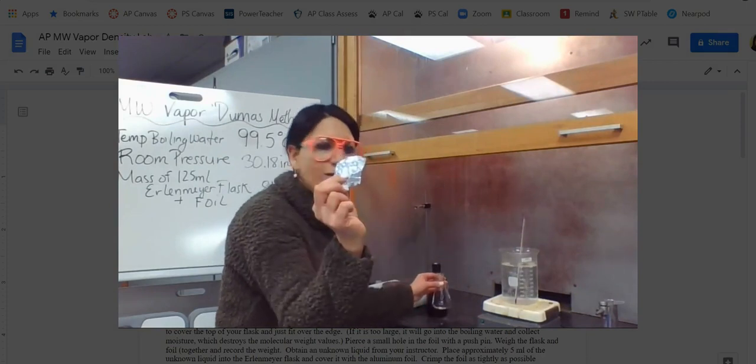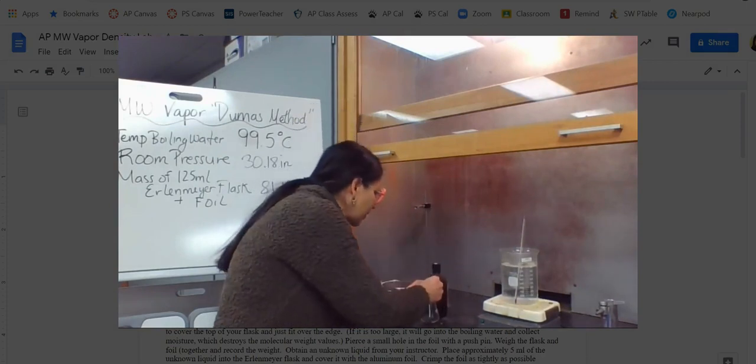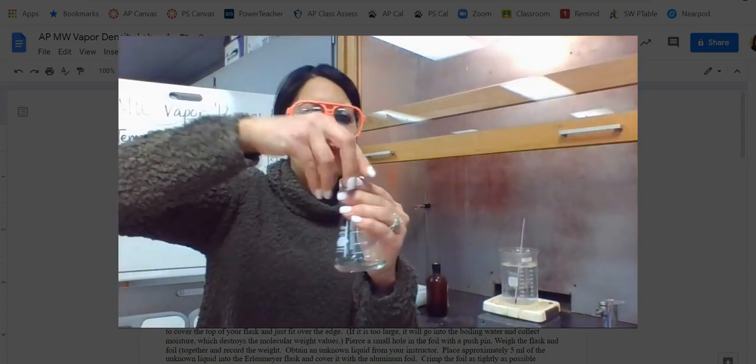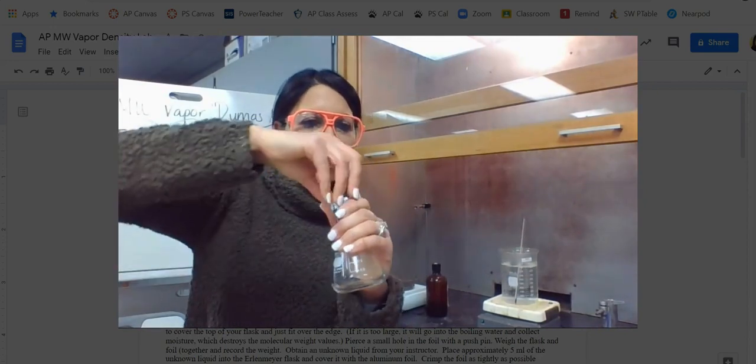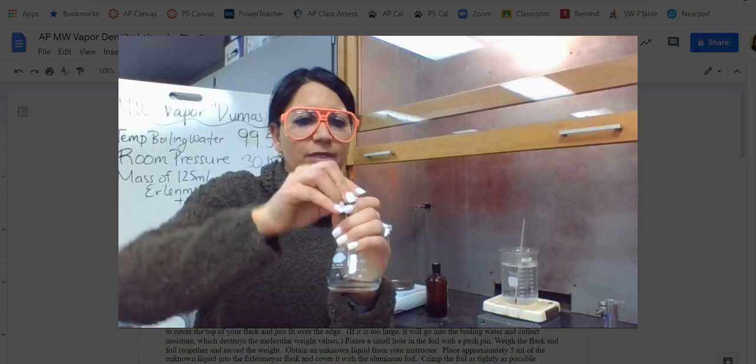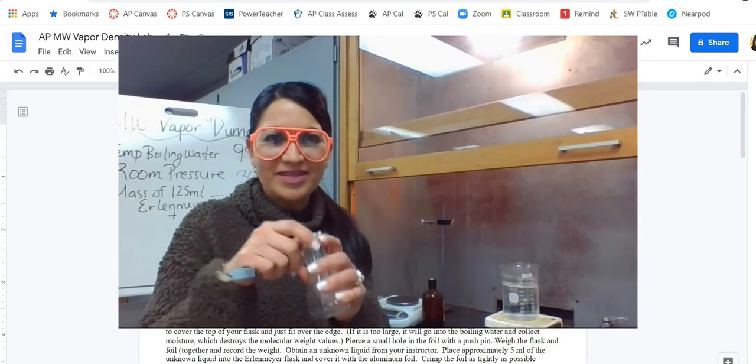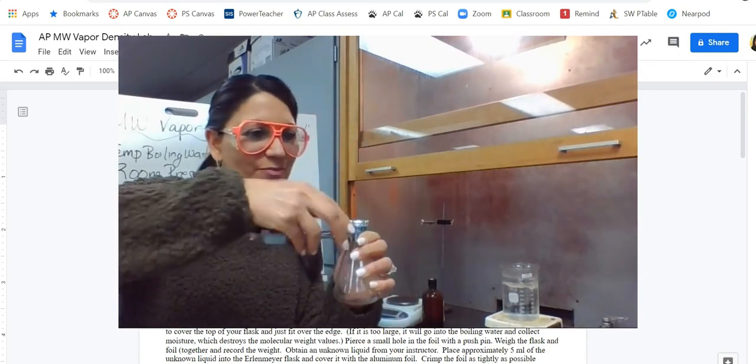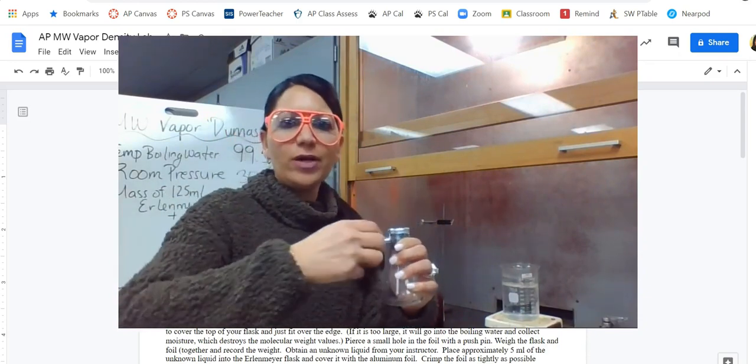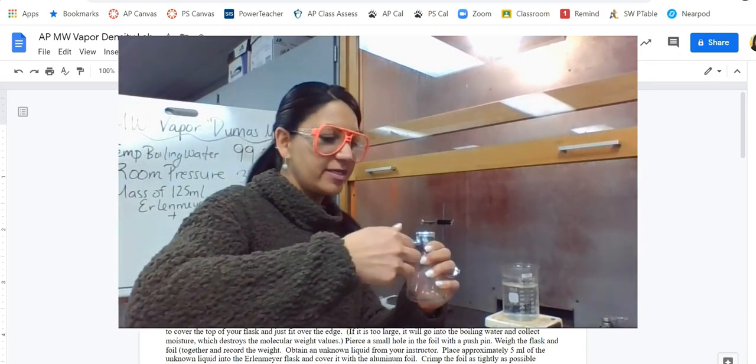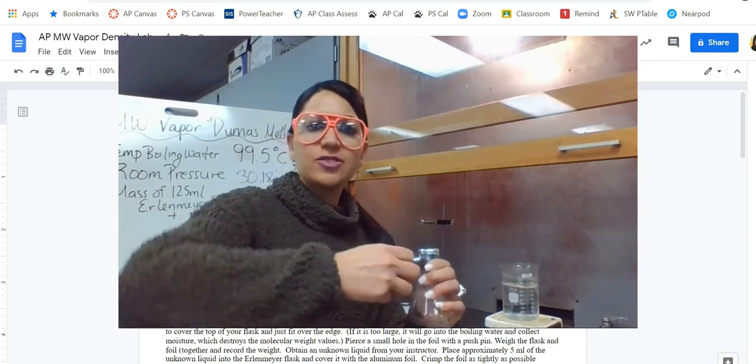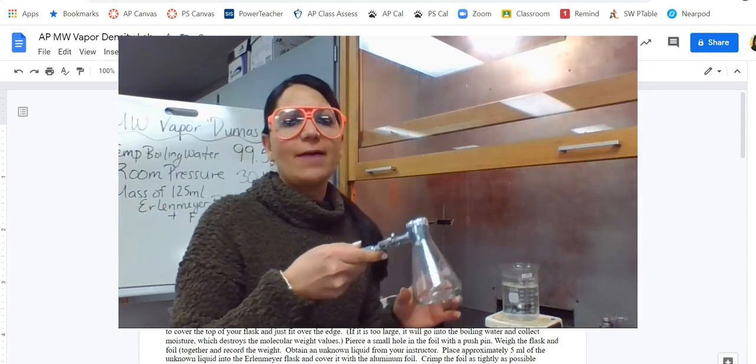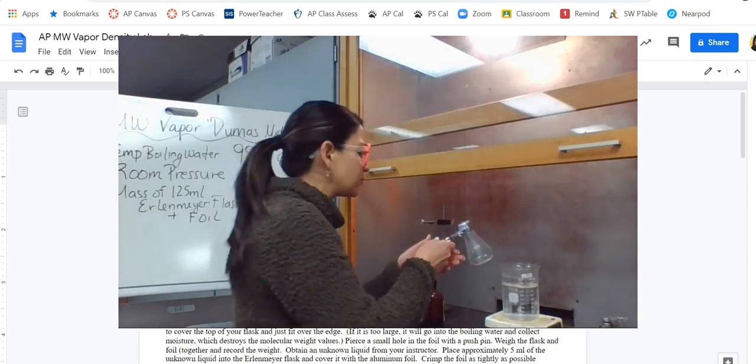So I did poke a little teeny tiny hole with my thumbtack. And so now all I'm going to do is I am just going to cover this up so you can see. Now what I don't want is I want to make sure that it's crimped on there really, really nicely so I don't want any gaps. And I've got this all crimped now and now I am going to just get my burette clamp on here. And so what I'm going to do is I'm just going to put it right into this boiling water right here and it's going to go for quite a bit.